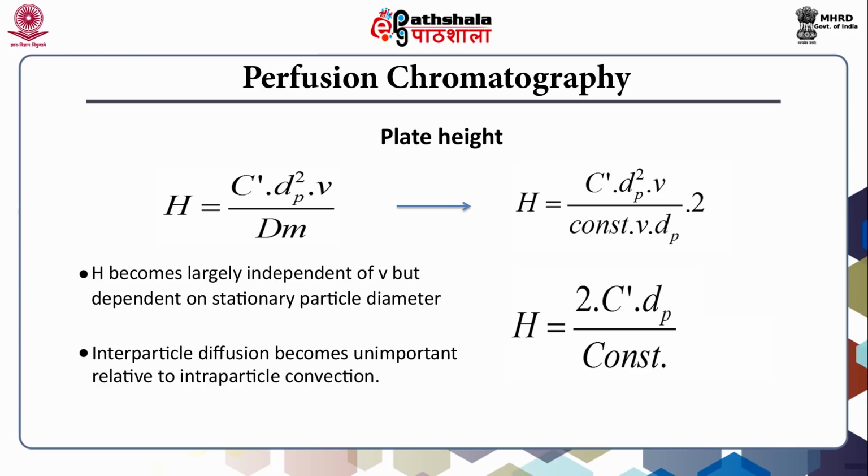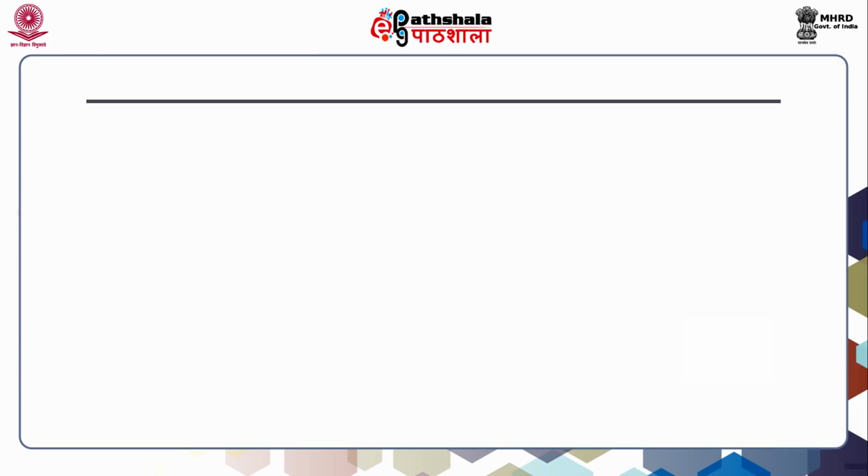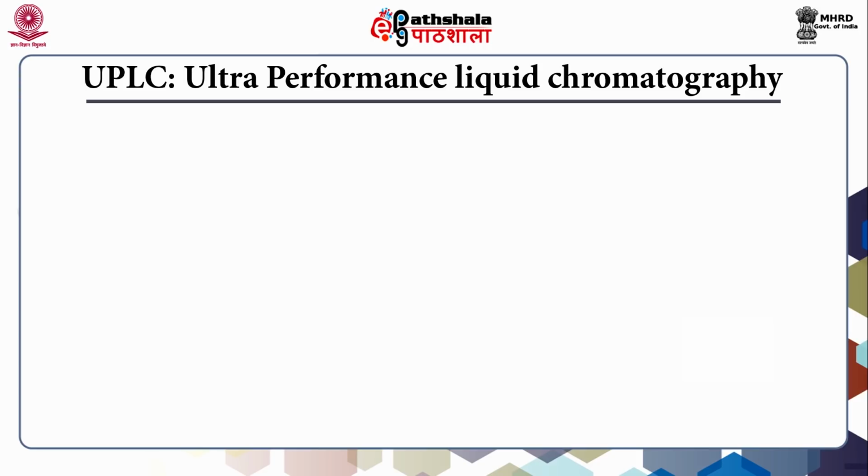resolution. Coming to the next slide, we will discuss another alternative to HPLC, that is UPLC. UPLC is called ultra performance liquid chromatography.